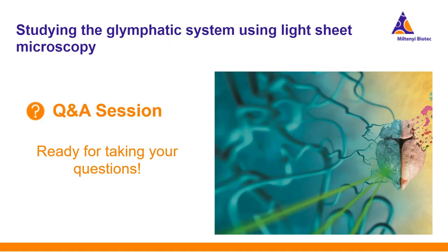Great, thank you. We have another question that came in, and it says, the disadvantage of light sheet microscopy is that it is difficult to perfectly align both light sheets in three-dimensional space. So what do you have to say about that? Yeah, I believe that this question could be relevant depending on the exact type of light sheet microscope that you use.